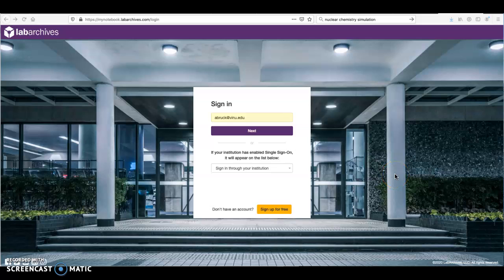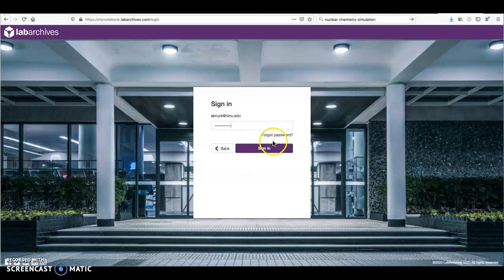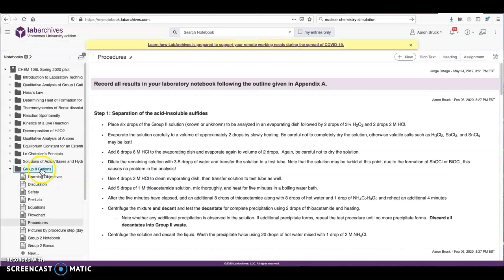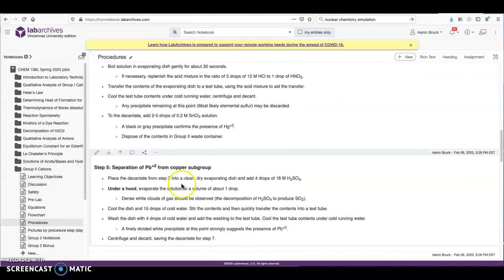Just a quick video for my Chem 106 students. This is how you're going to access the material for the Group 2 cations. So here I am on the Lab Archives login page, and if I log in like you would, it should take you to the Group 2 procedures. Everything here is exactly the same as before.